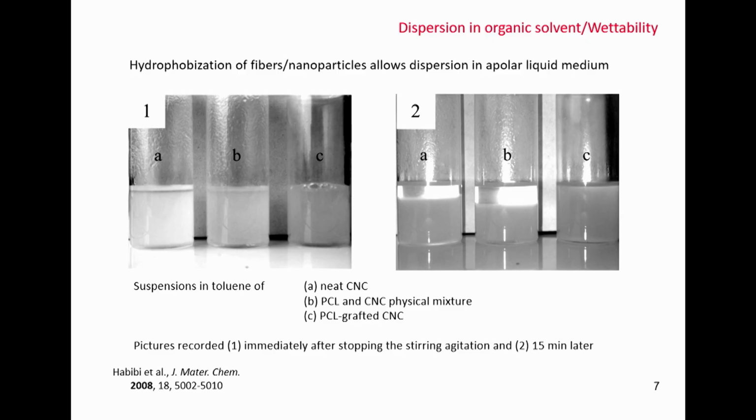In fact, when the fibers or nanoparticles are hydrophobic, they can be dispersed in apolar liquid medium. You have an example here where you have neat cellulose nanocrystals. 1 and 2 refer to the suspension immediately after stopping the stirring agitation, and here it's 15 minutes later.